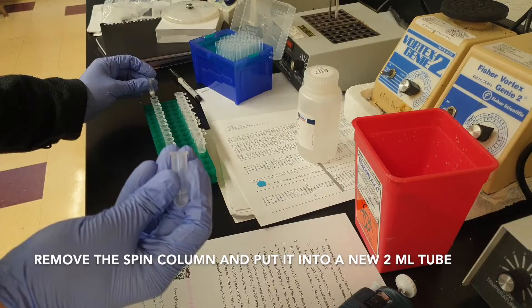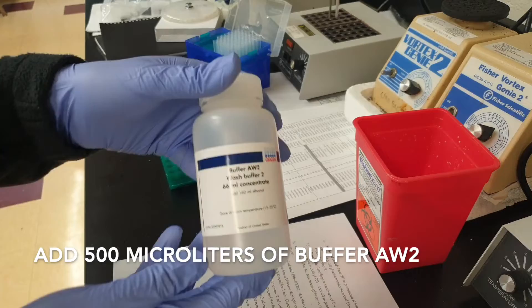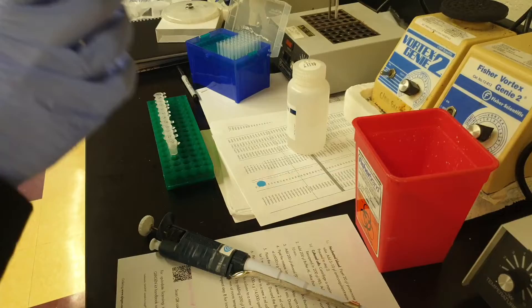Once that's done, discard the flow-through. Place the spin column into a new 2 ml tube and repeat pretty much the same process with buffer AW2.